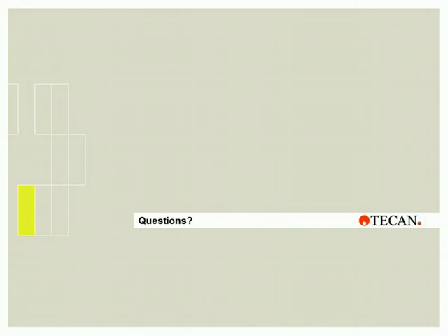Next question we have, how many drug combinations can you analyze per week using this software? So the software that we're using here, we've written a script for the analysis. So it pretty much depends, first of all, of course, on the quality of the data. We can run quite a lot of the 384 well plates that we're using as the basis of our assay, and we probably could run more of them than we're interested in analyzing, because the amount of data that we can actually produce is not now limited by the dispensing of the reagents. It's more like in the analysis.